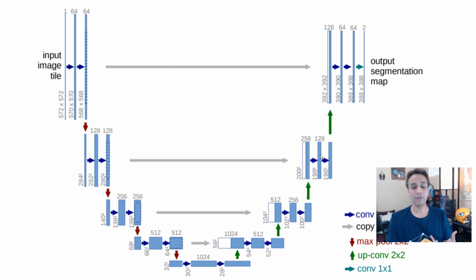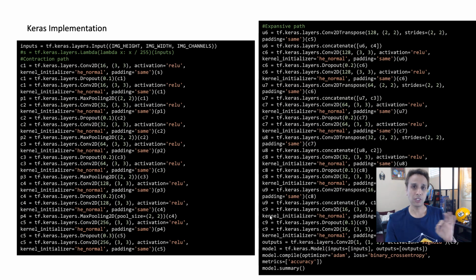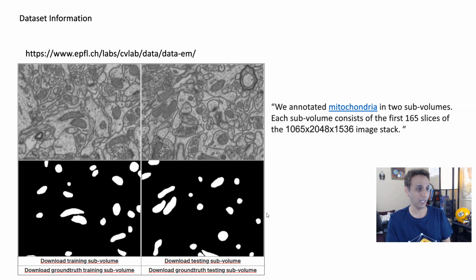You can do all these tricks as long as you do these concatenations and combine these. So you've got to be a bit better at imagining how this would look if you put in your own network. For this exercise, I'm going to use the standard UNet, and it actually works amazingly well on most of the data sets, at least the ones I have tried.